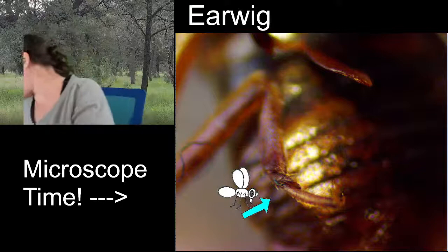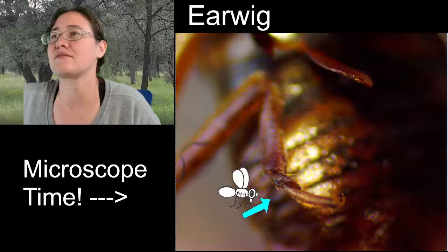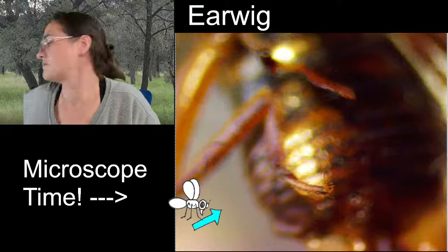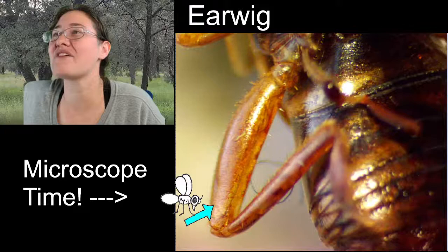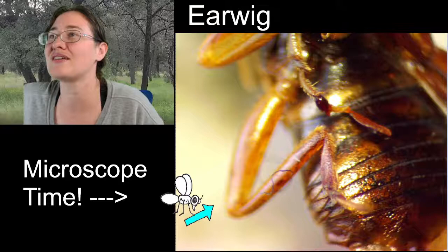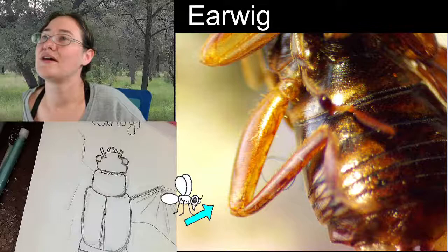We've seen that in other specimens, I'm sure. And admittedly, I'm pretty happy with the hind leg. It's all level and in one spot, so it might be a good one to just focus on. I don't understand what's happening at the end of the second leg. Okay. Oh, I bumped it. There we go.